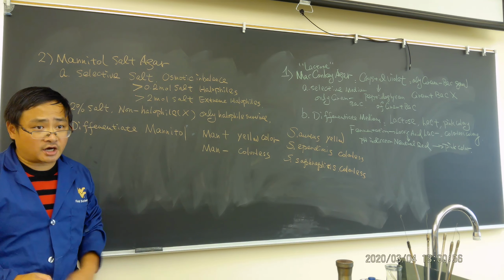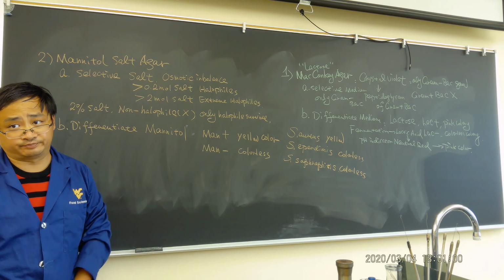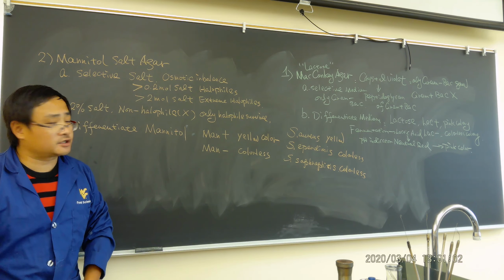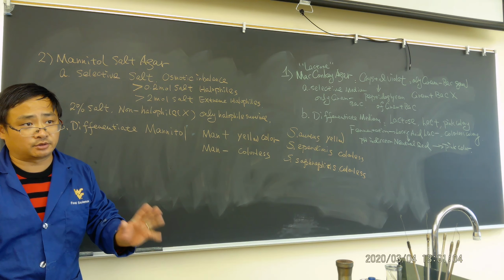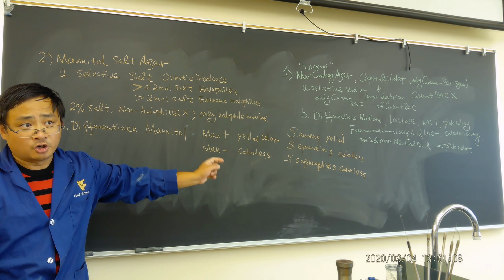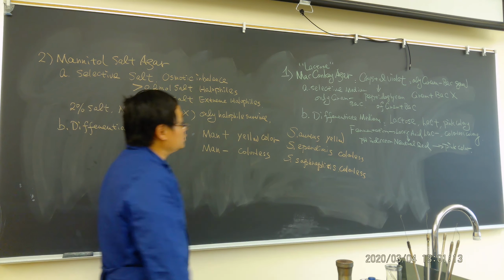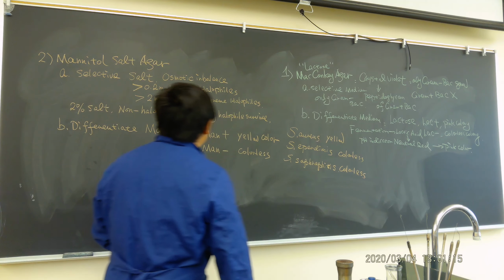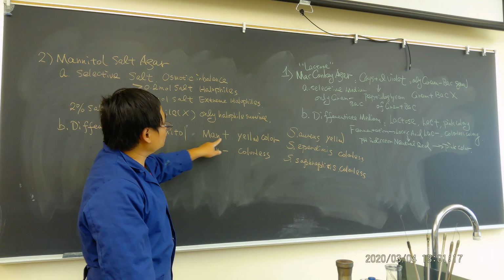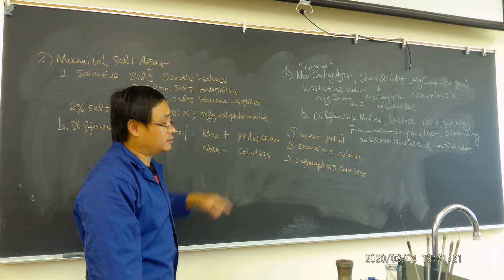Why is Staphylococcus aureus more important? Because it causes food intoxication. And then Staphylococcus epidermidis is normal bacteria on the surface. Saprophyticus is honeymoon bacteria, only for sexually transmitted infection. That's why it's an easy, quick test. Now, the same question: why will mannitol fermentation positive have a yellow color?